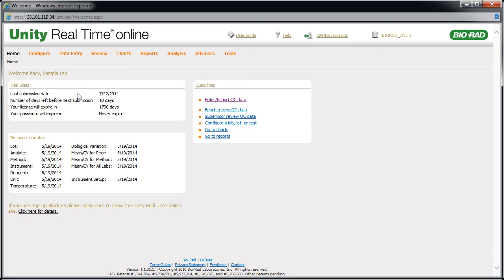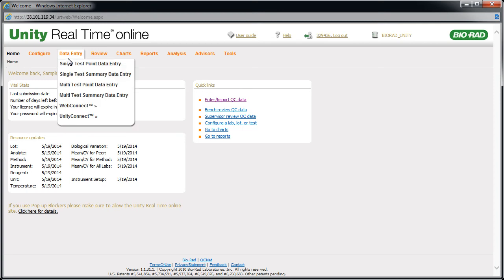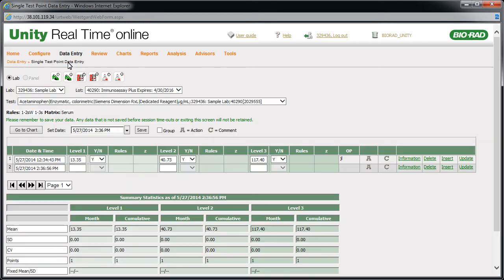If you've not submitted your data, return to the Single Test Point Data Entry page. Click the field you want to edit. Change the value, then click Save.